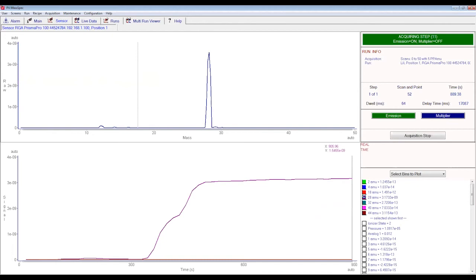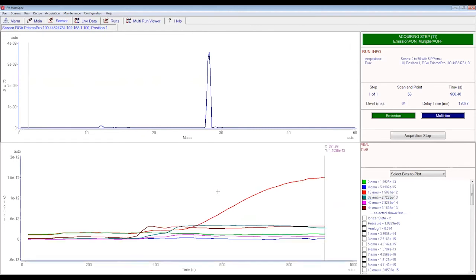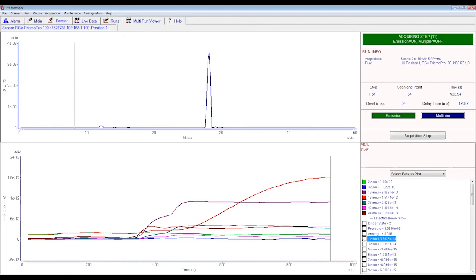If I fill it out, you can see in the beginning that when we introduce the CO, there might be, oh, this is actually from the previous one. No, start again. So somehow water is increasing. Looks like there was probably some rest of the water in the pipe, or it just stands for a longer time. But the signal is actually e-12. It's e-13, it's quite negligible. This is our background. Sorry, not 13. 28. It would be 28.